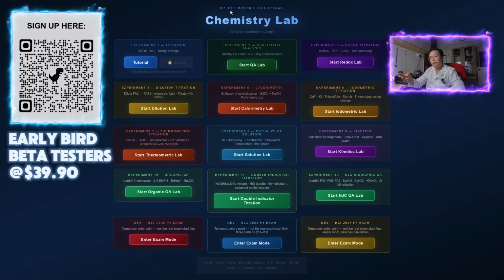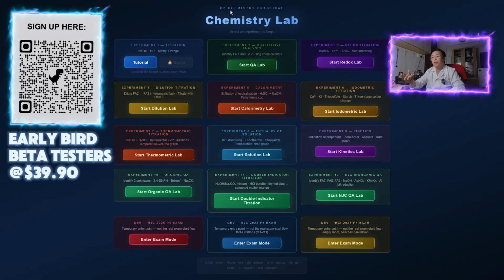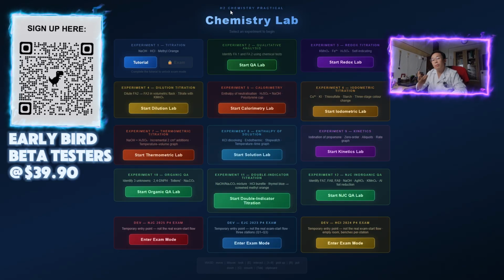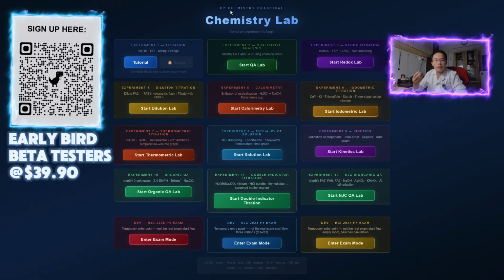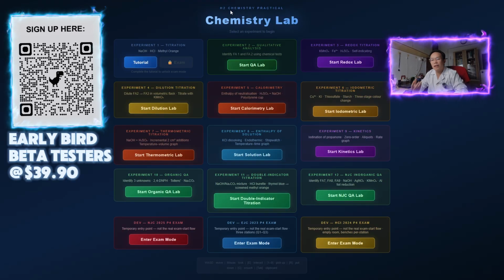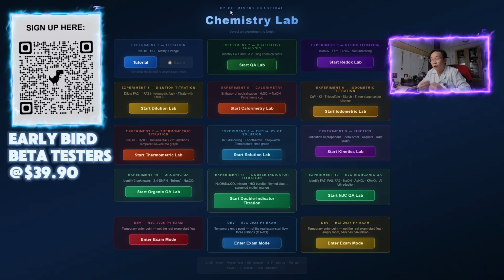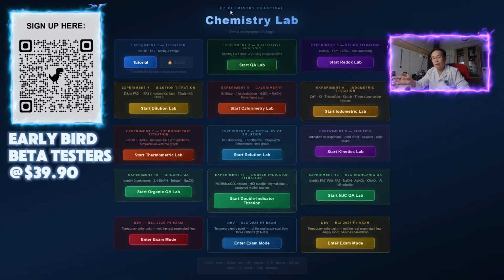In the past 2 videos, we have showed you how to perform your QA using my ChemLab simulator and also titration. And more importantly, you were able to see how realistic they were, how they were going to help you prepare for your A-level or O-level exam. Because most of you wouldn't get enough practice for your experiment, not enough hands-on experience, and therefore that's where a lot of you will feel nervous ahead of your experiment. And that was precisely the reason why I came up with this ChemLab simulator.